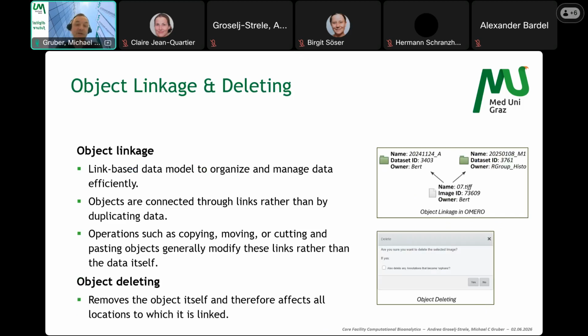Now some words about how data is organized in OMERO. The data is organized by a so-called link-based model, where the data is not duplicated.